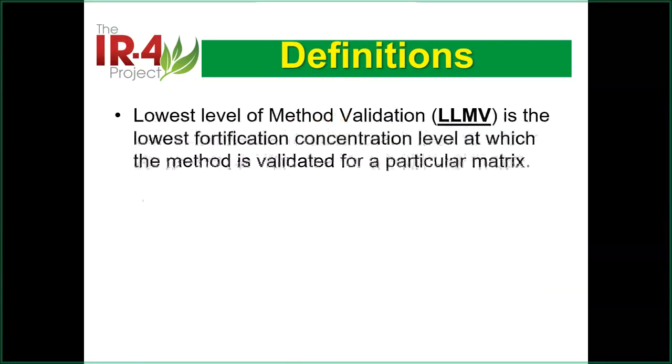But in order to make it easier, in IR4 and probably most EPA GLP systems, we use a different term. We call that LLMV. Now, this is not science. This is a regulation. Why? Because we are talking about the method validation. We are talking about MV.